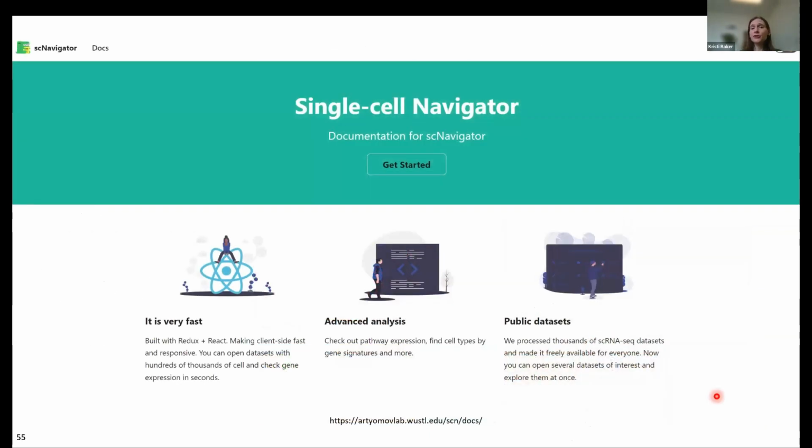Now, the other thing I want to just briefly touch on is single cell sequencing. Some of the data sets, so in the GEO database, you can download single cell sequencing from there. You can't do the analysis for single cell sequencing there because the analysis for single cell sequencing is quite a bit more challenging than just for total cell sequencing.